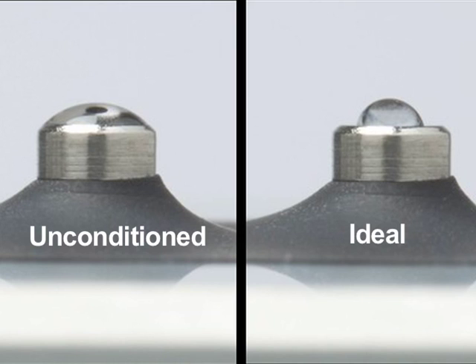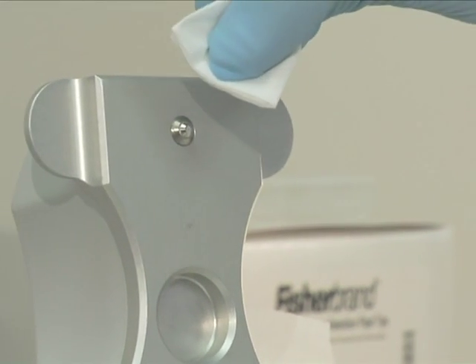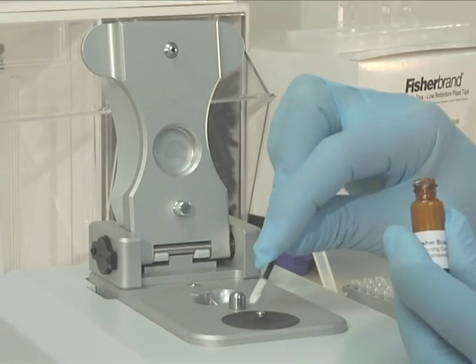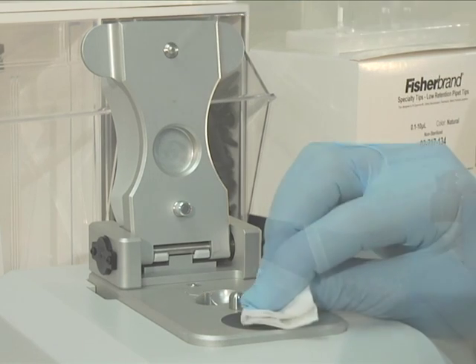A flattening of the droplet on the lower pedestal is indicative of the optical surface becoming unconditioned. To recondition the pedestal surfaces, either buff them vigorously using a laboratory wipe, or the preferred method is to use the NanoDrop Pedestal Reconditioning Compound, PR1, as directed.